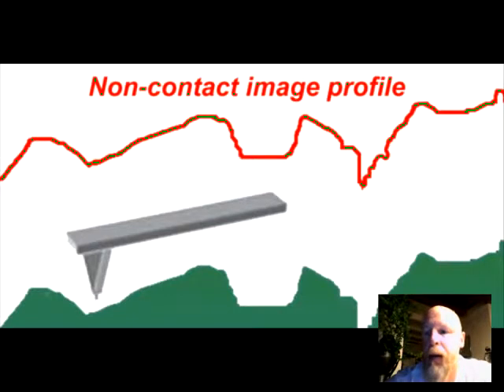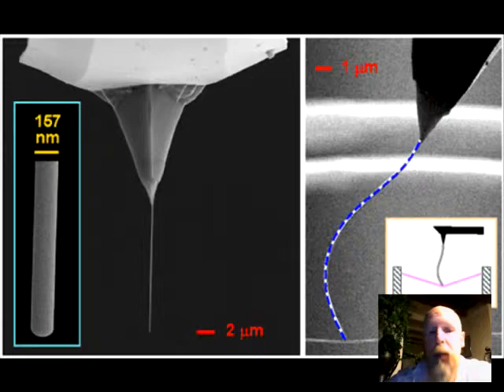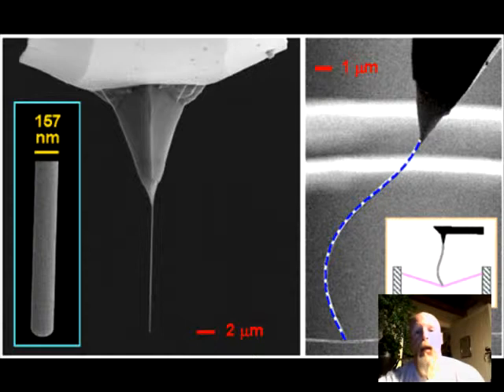Our next slide here shows some close-ups of the probes and the tips of the atomic force microscope. A typical tip radius is from a few to tens of nanometers. AFM tips and cantilevers are microfabricated from silicon and silicon nitride. Cantilevers range in size, but are typically about 100 micrometers in length and 20 micrometers wide by about a half a micrometer thick. The first atomic force microscope was actually a diamond tip glued to a gold-filmed cantilever. Pretty expensive stuff there.